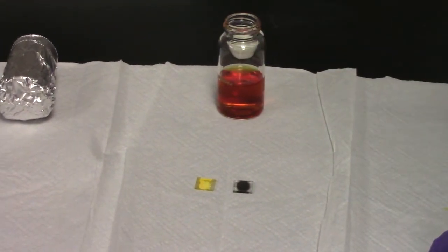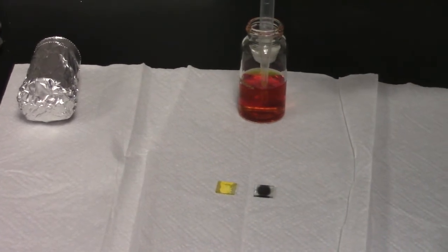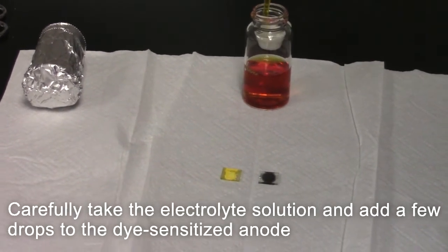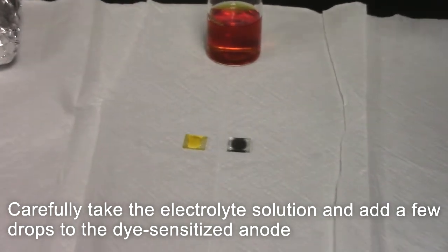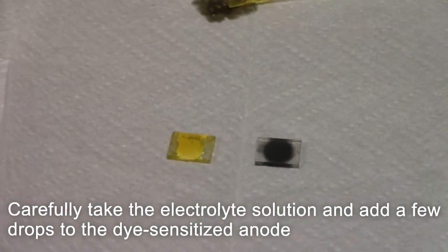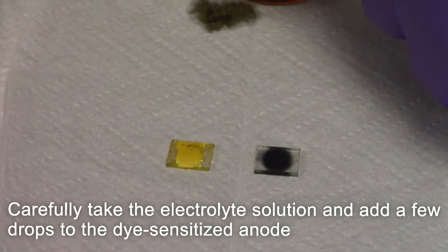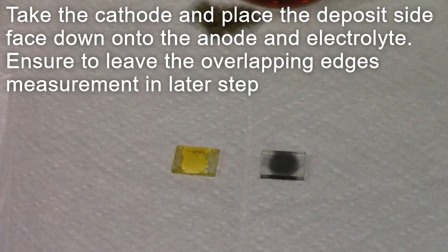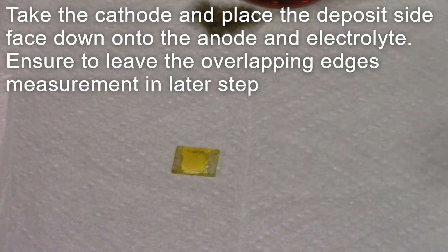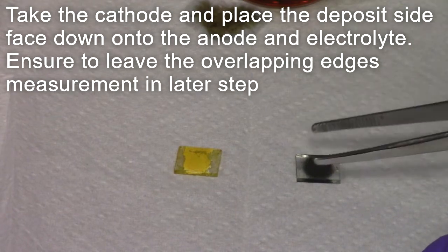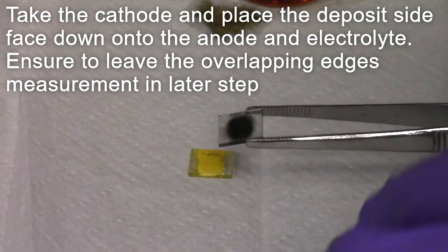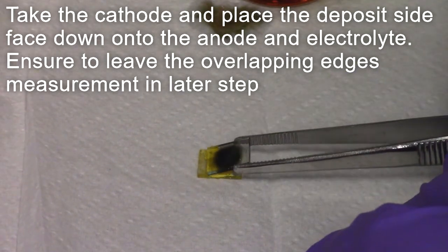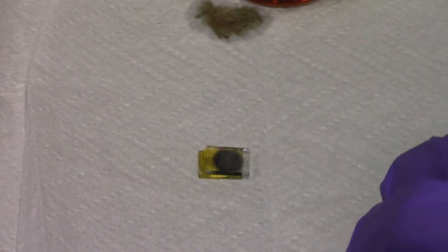Begin by taking a small amount of the prepared electrolyte solution and carefully add a few drops to the dye-sensitized anode. After the electrolyte solution has been added to the dye-sensitized anode, take the graphite deposited cathode and place the deposited side onto the dye-sensitized anode and electrolyte solution.